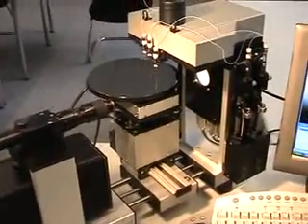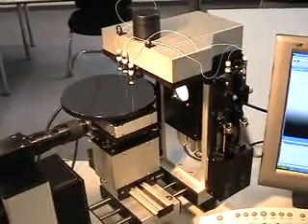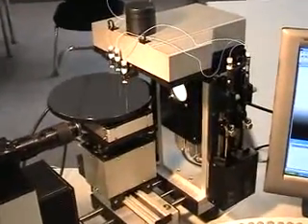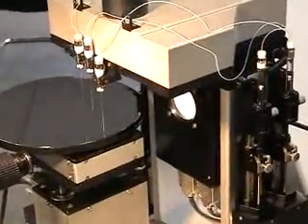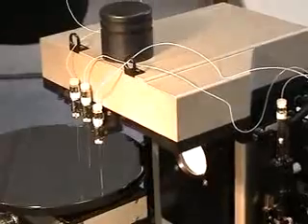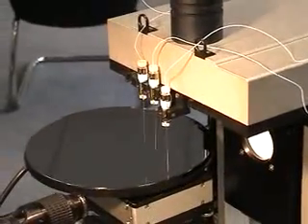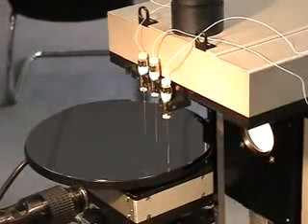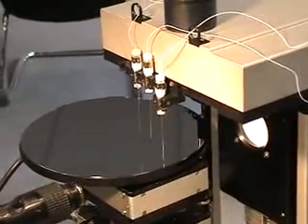We show on the right hand side the backlighting illumination and the multiple dosing system for up to four dosing needles.